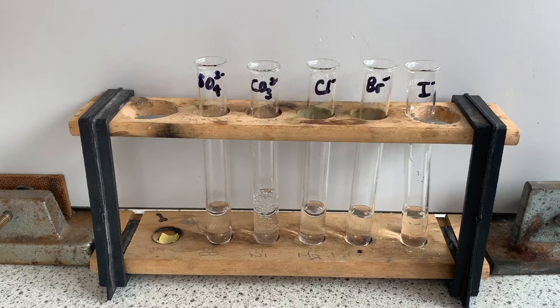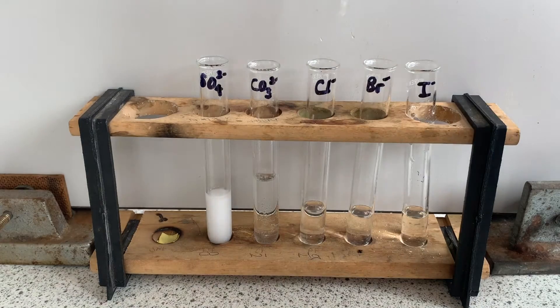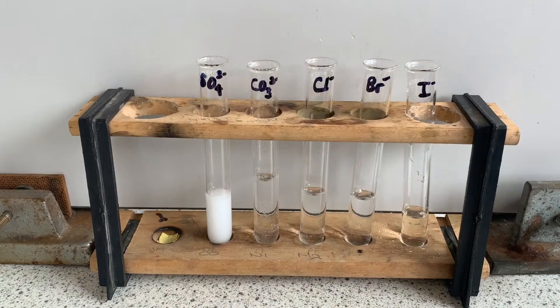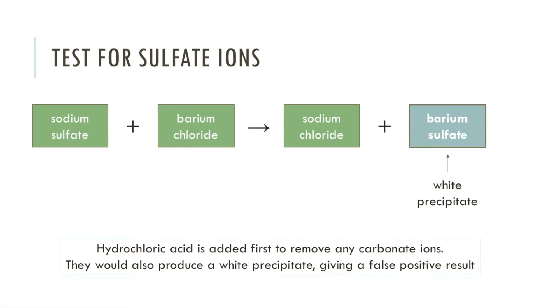Now I'm testing for the sulfate ion. Keeping the solutions as they are with the hydrochloric acid added, I'm additionally adding barium chloride. You can see when added to the sodium sulfate a white precipitate is formed, whereas no precipitate is formed with any of the other solutions. When barium chloride reacts with sodium sulfate, barium sulfate is formed and that's the white precipitate you can see. We added hydrochloric acid beforehand as that removes the carbonate ions. If we hadn't done that we would have gotten a false positive because the reaction with sodium carbonate and barium chloride also produces a white precipitate. So we do need to add hydrochloric acid first to get rid of the carbonate ions.